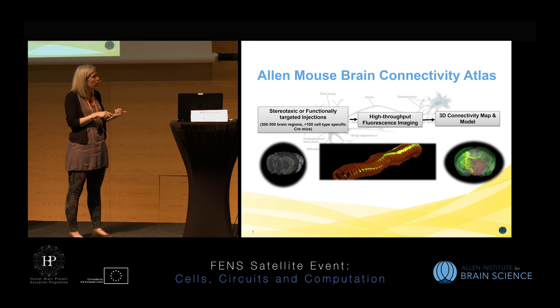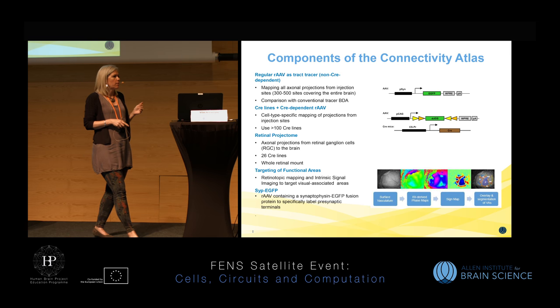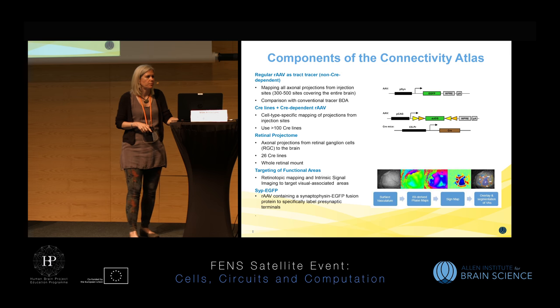You can see both the red, the autofluorescence from which we created the common coordinate framework, as well as the green signal in the green fluorescence. And then our informatics data processing pipeline allowed us to put that into the three-dimensional space. So, the different components of the connectivity atlas.